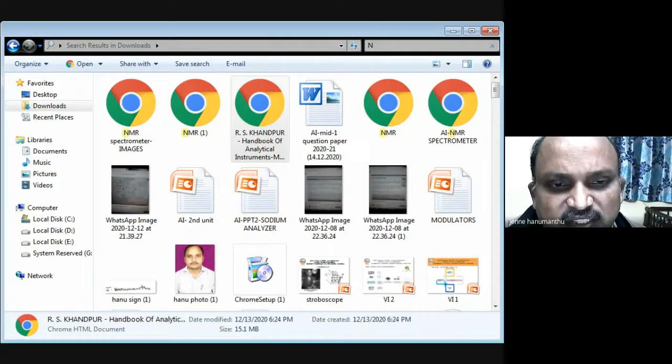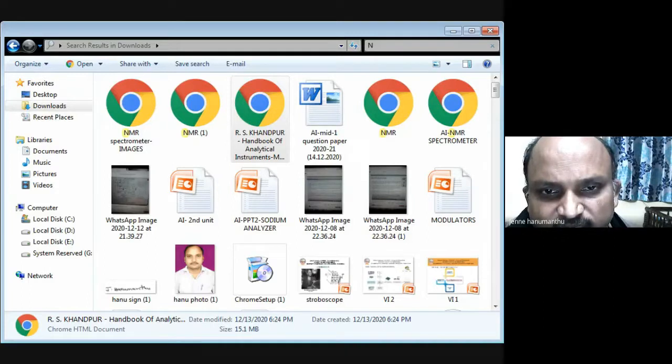In this cavity, there is a sample. This sample is placed between some magnetic field. From this, that is given to variable attenuator, oscillator, and crystal detector. The crystal detector detects the reflections coming from this cavity, and that detected output is going to give some amplifier and some multimeter.